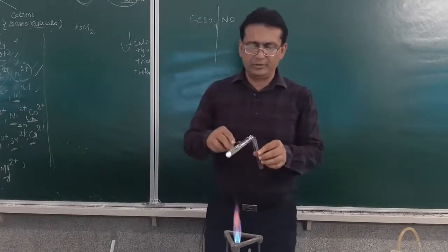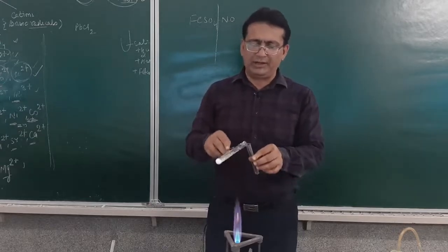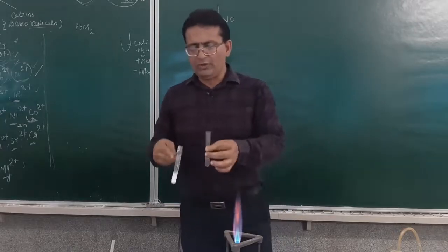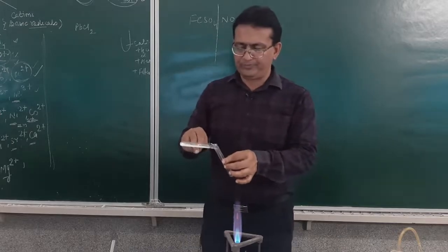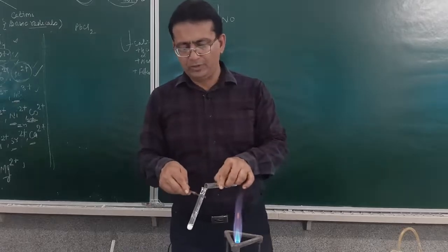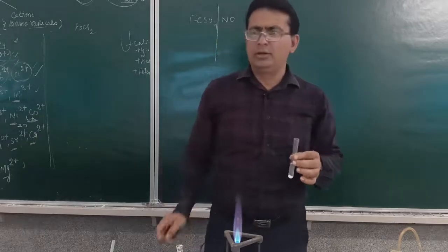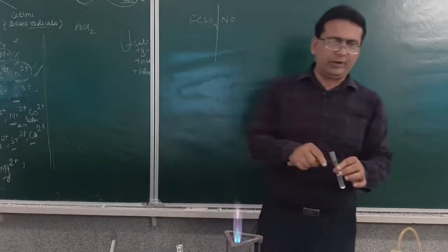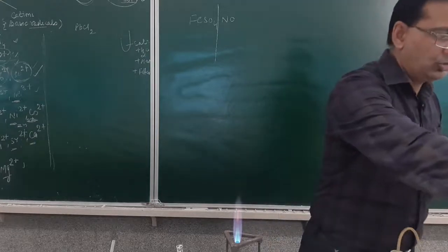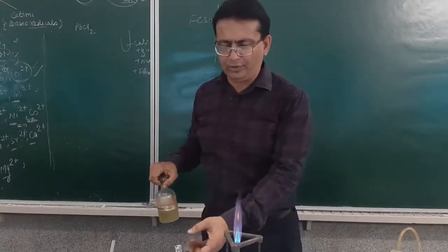To the first part, we will add potassium iodide. You may look at your study material also. The confirmatory test of lead is given. Divide the solution into two parts. Am I clear? Once you divide the solution into two parts, just see over here, you have taken this solution of lead chloride in the hot water. Now to this, you will add a potassium iodide solution.